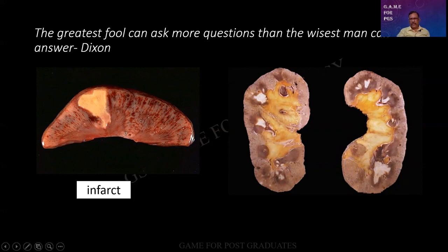And this is a special type of renal necrosis. I find that the renal pyramid, part of it is being necrosed, whereas the remaining is viable. Part is necrosed, remaining is viable. Generally, they say 1/3 can be necrosed, remaining 2/3 is viable, or vice versa. This happens in a case of necrotizing papillitis, in a case of diabetic kidney. So what are all the different types of necrosis you people should be able to mention?